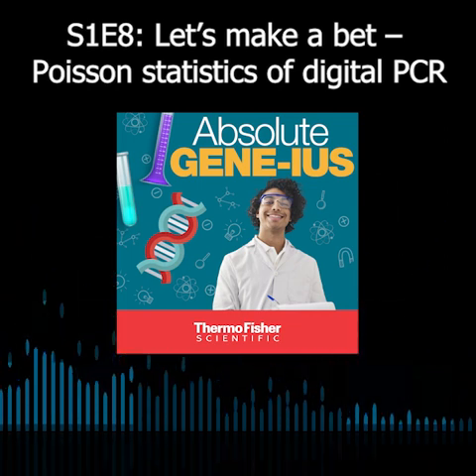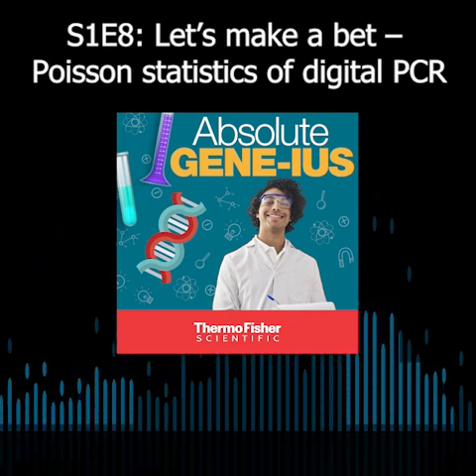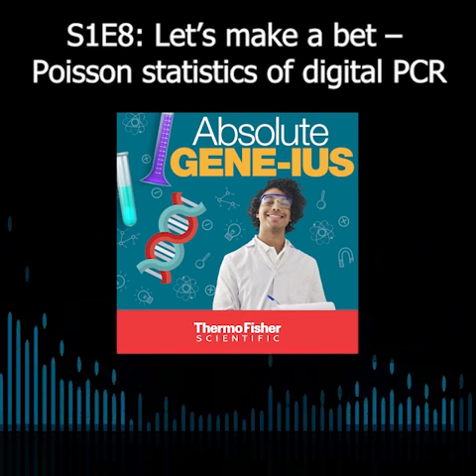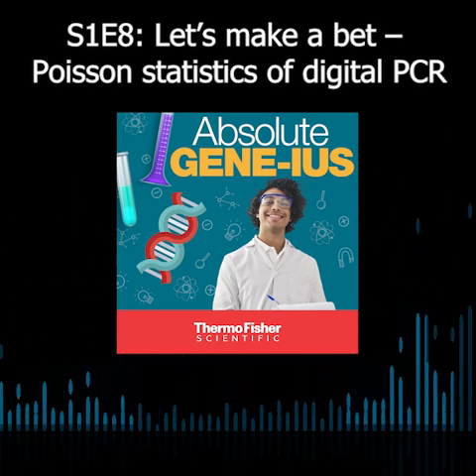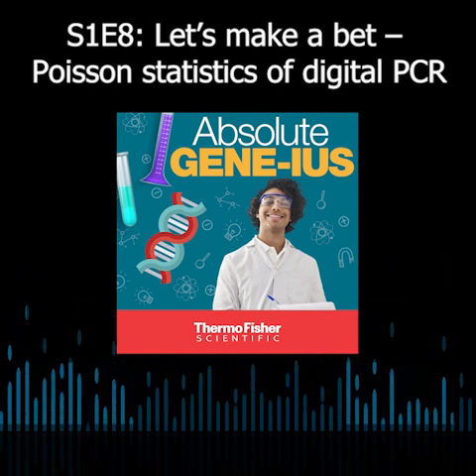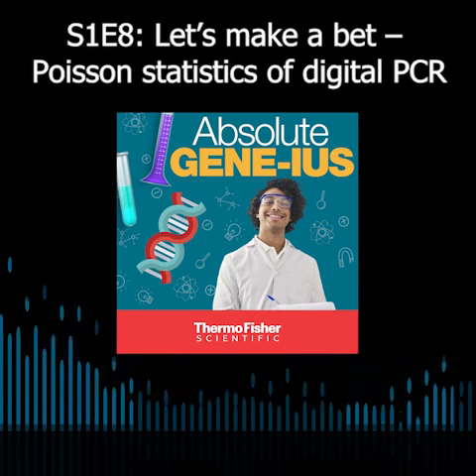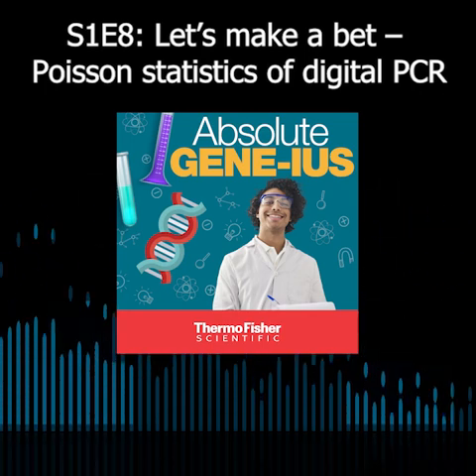So going back to the micro chambers and micro reactions, what is the benefit you get as you get higher numbers of these micro reactions? Yeah, there's definitely benefit in having more micro reactions. I mentioned before that you get a little bit more dynamic range as you have more, but there's also the concept of the precision, how much certainty you have in that concentration.